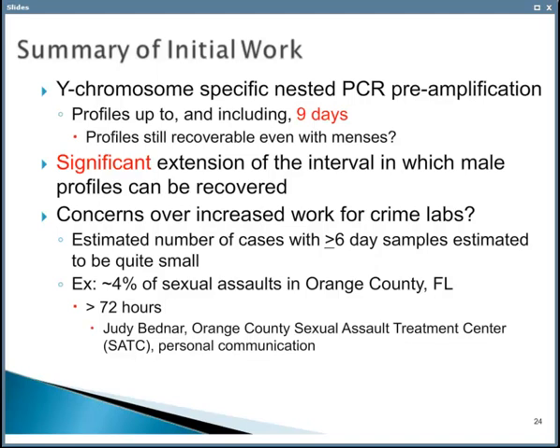This is work that we've just recently got accepted for publication. This is a significant extension of the interval by which male profiles can be recovered. Previously we'd found 5-6 days, but we're confident now that we can get results 9 days after the incident, and some of the data I will show you will support that later on in the talk.